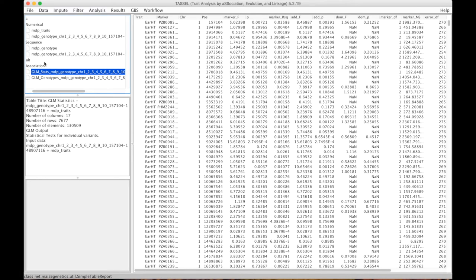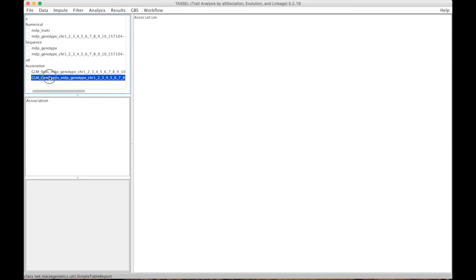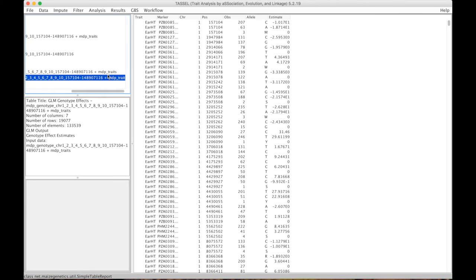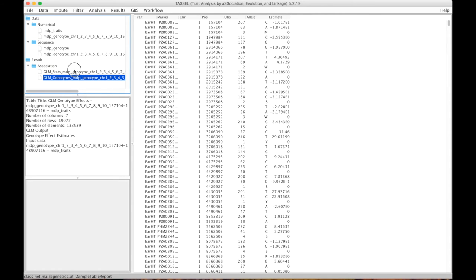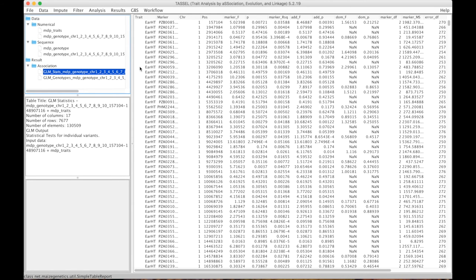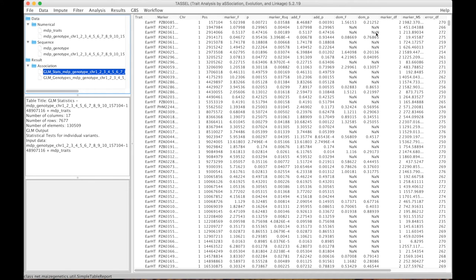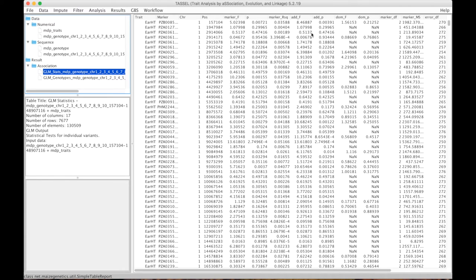So now we have two files. The association files, we have the one that contains the allelic effect estimates, so it's the second one. And then the first one which contains the F statistic and the p-value which is just the measures of significance. And it contains all sorts of other information. You can also do, this is assuming the additive model, the dominance model is also implemented if you want to look at it.